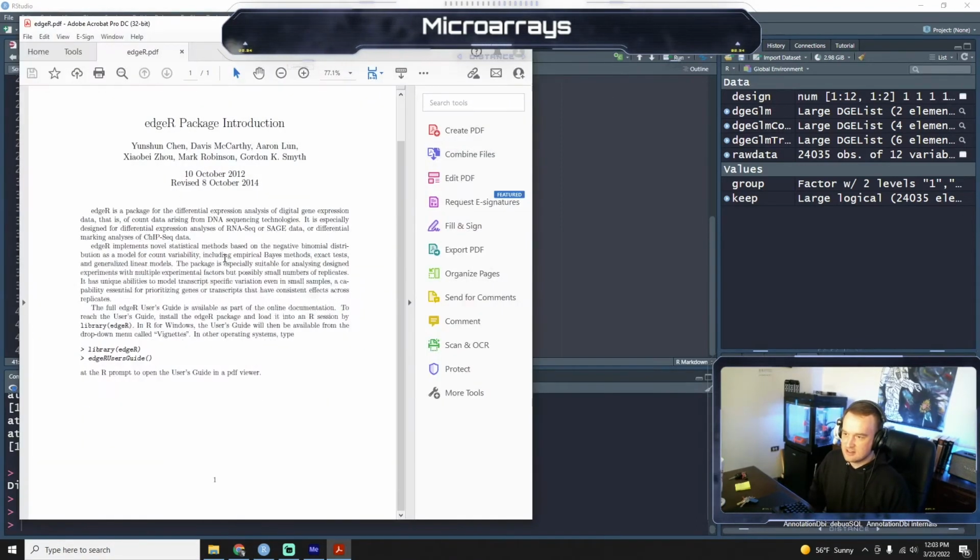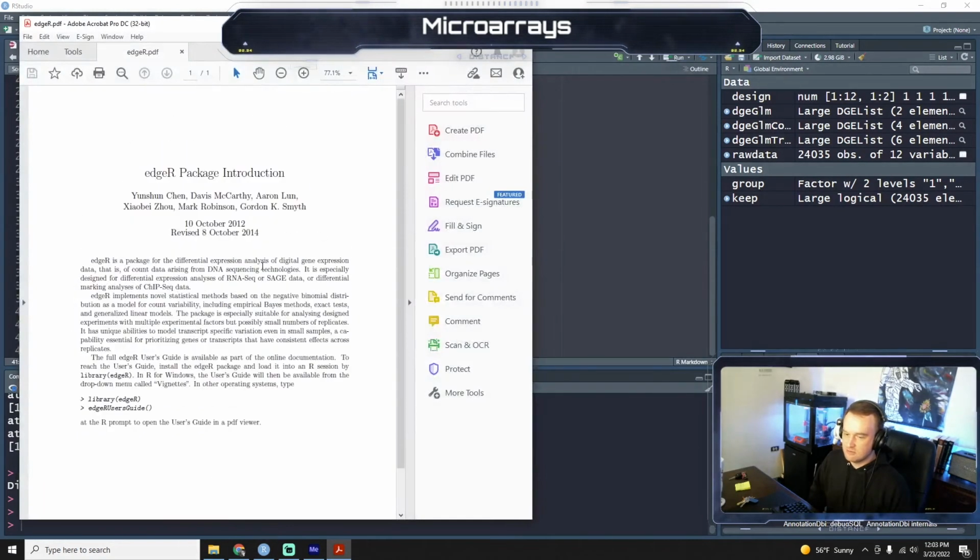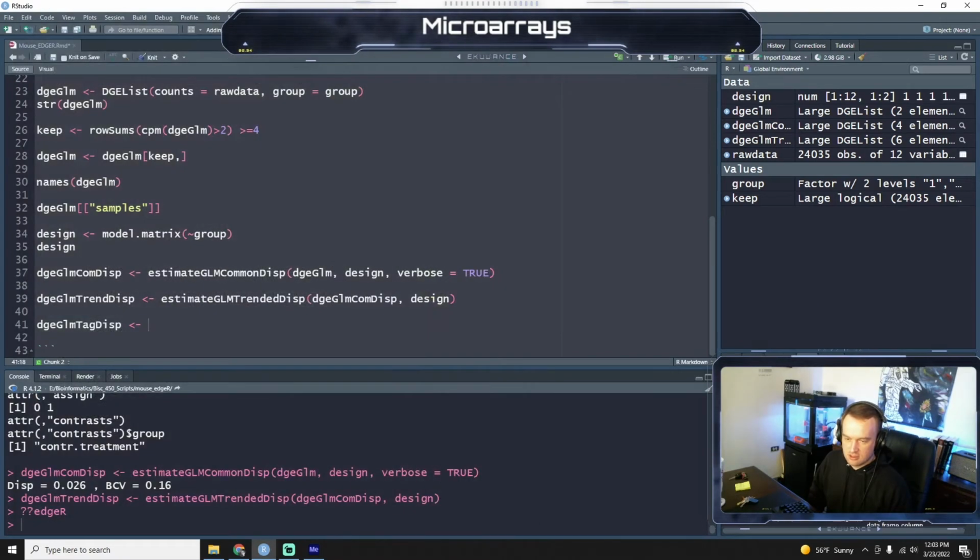so you can get this. That's just the introduction. So you can get the PDF. Why does it just give me an introduction? You might have to Google it. Oh, it's behind my picture here. I'm looking at the help viewer. But yeah, if you're interested in more of the background of these things, I encourage you to look at it.